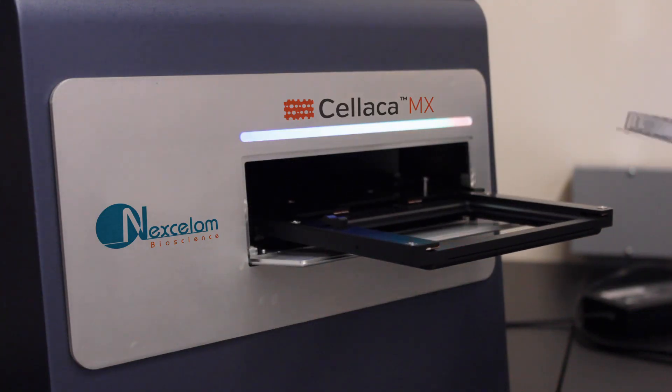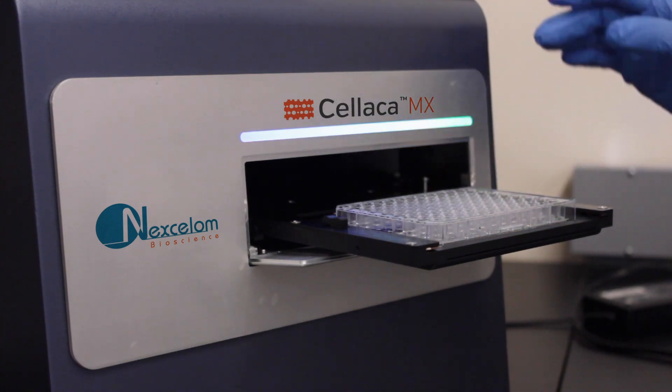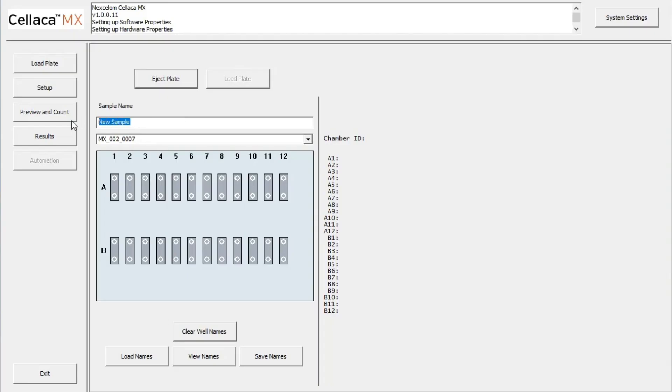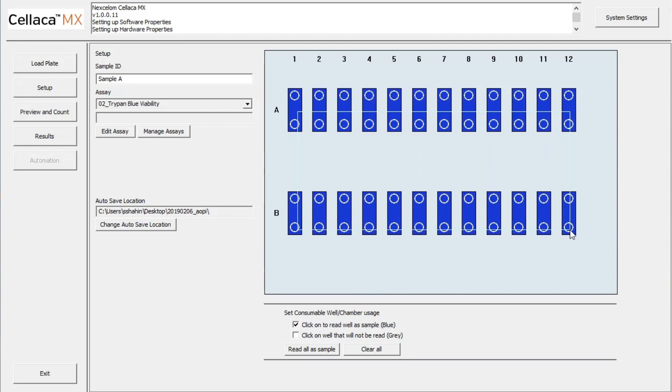Place the prepared consumable into the instrument, enter the sample name, and click Setup. This window allows you to select the Trypan Blue viability assay in the drop-down menu, as well as choose which wells to image.